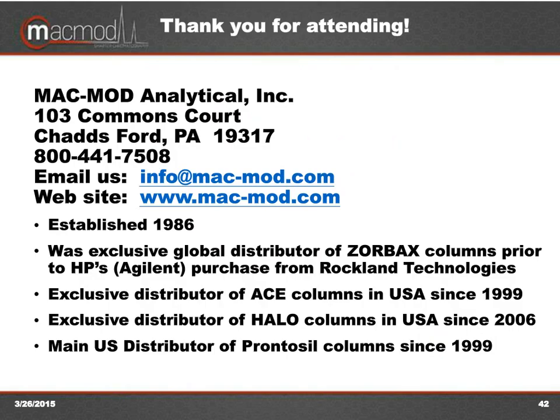But there's also a number of different tools out there right now that go beyond what some of our customers have been using for a long time, which is percent carbon load, porosity, and bonded phase load, in terms of surface area, meters squared per gram, and so on.